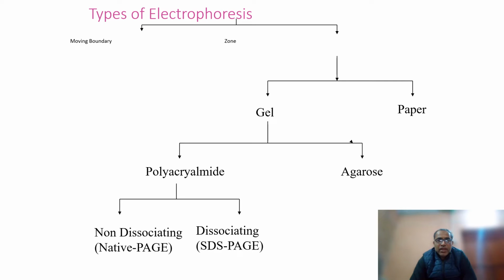Then types of electrophoresis. One of those we just discussed, the agarose gel electrophoresis, which is horizontal gel electrophoresis, which we use for DNA, for quantification of DNA, for example, when we digest DNA with restriction endonucleases, or analyze cloning of an insert in plasmid vectors. When we digest those plasmid vectors, we can use agarose gel electrophoresis for analysis.